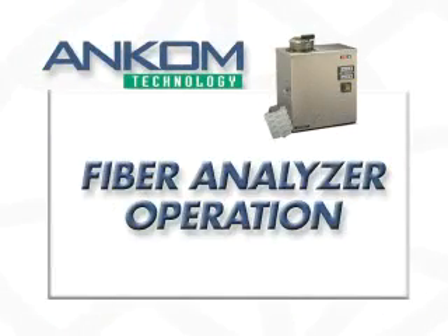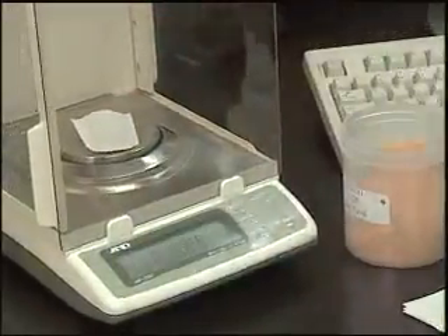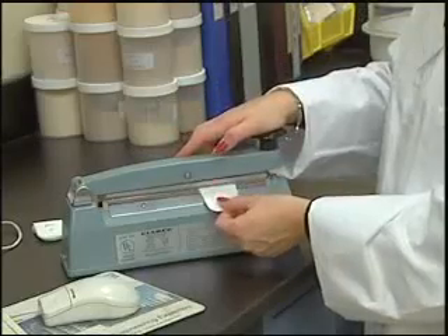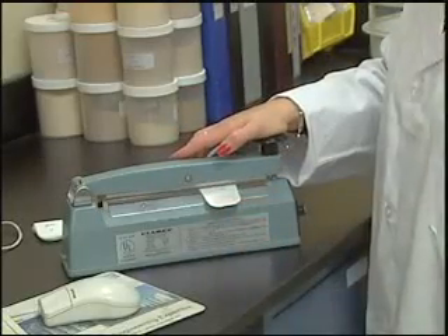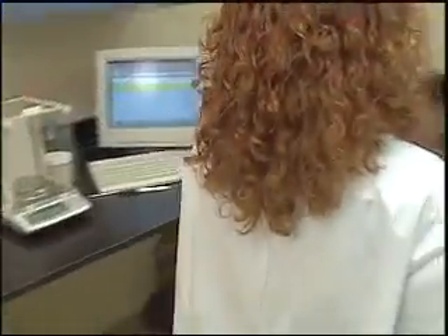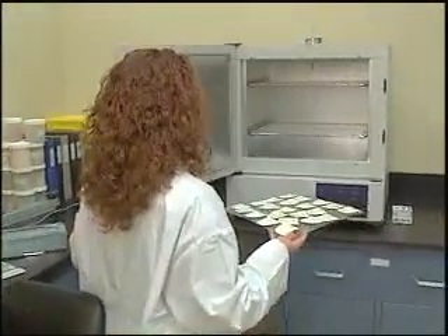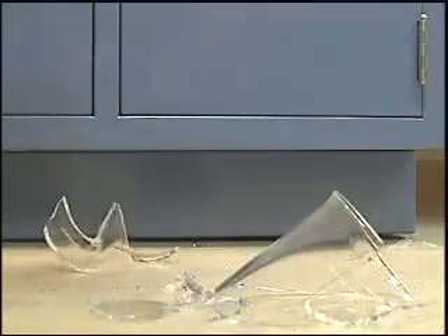To begin, the user simply weighs sample directly into an F57 filter bag. The filter bag is then sealed and the next sample prepared. One of the advantages of filter bag technology is that each sample is encapsulated so that sample transfer error is eliminated, and dropping a sample does not mean replacing glassware and preparing a new sample.